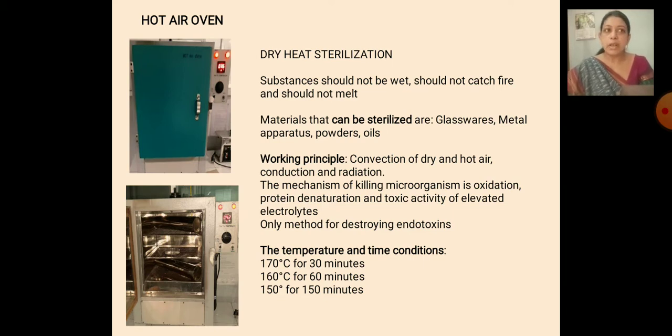So what is the process? After washing and cleaning with soap, we wash with running tap water, then rinse with distilled water. After that, we air dry it.